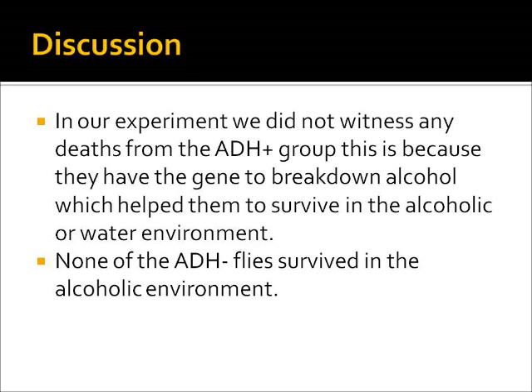So in our experiment, we did not witness any deaths from the ADH plus group. This is because they have the gene to break down alcohol, which helped them to survive the alcoholic or water environment. However, none of the ADH minus flies survived the alcoholic environment because they did not have the gene to break down alcohol.